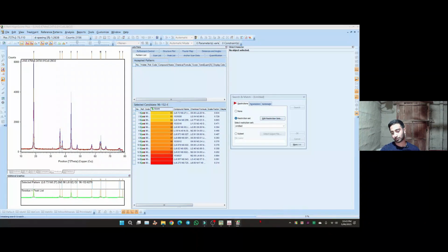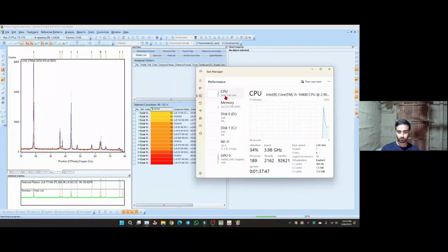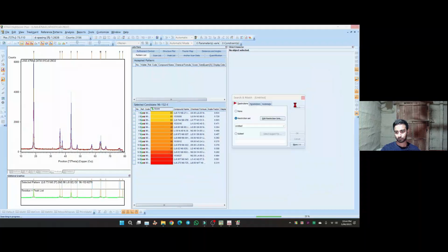It will go up to 100, so it may take some seconds. So please stay tuned. Okay, 25% is done and 75% is yet to be done.